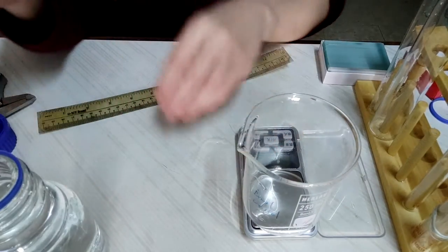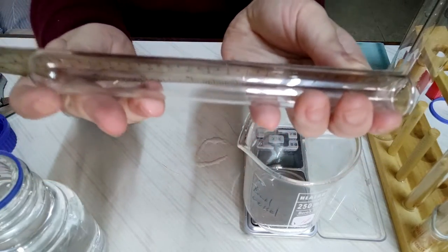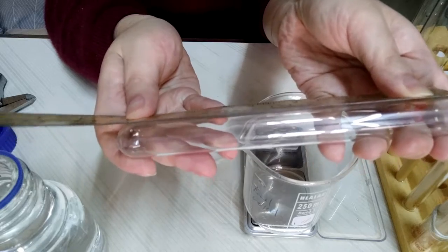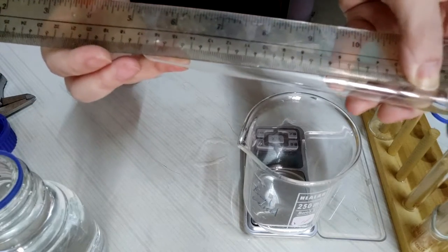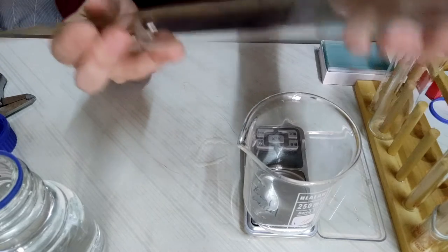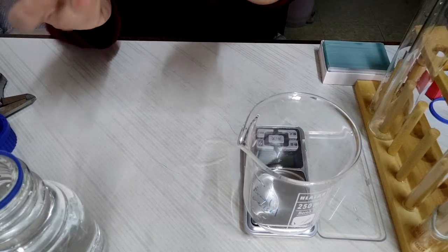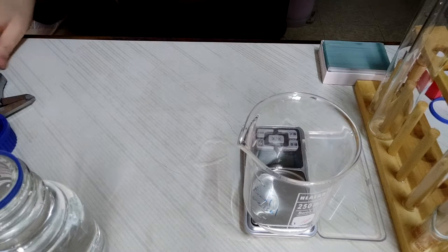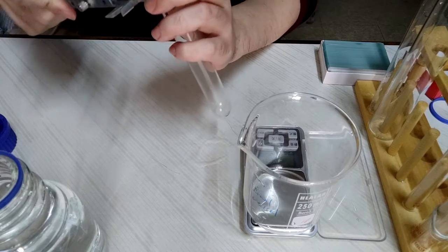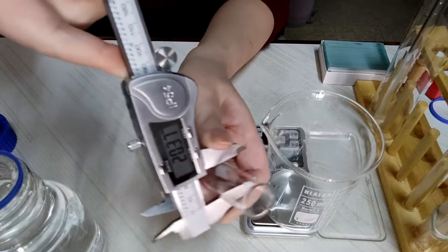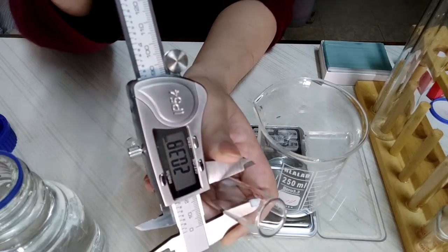And now for the larger test tube. This is around 17.5 centimeters. The external diameter is around 20 millimeters and internal diameter is around 17 millimeters.